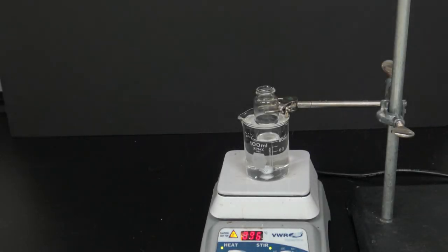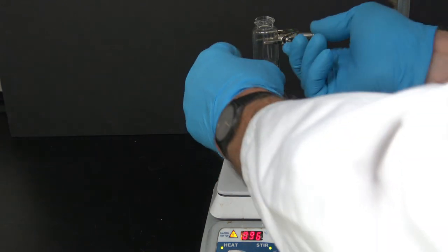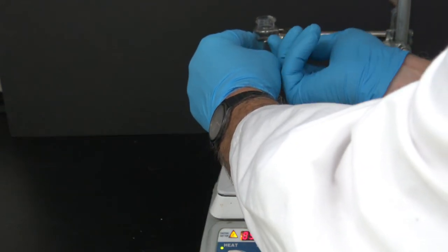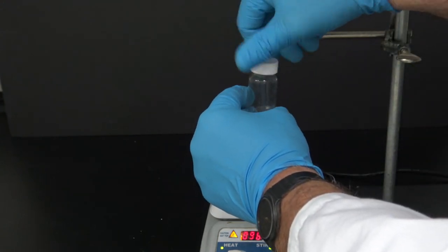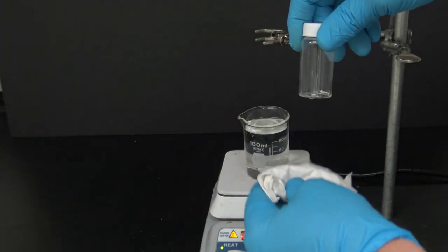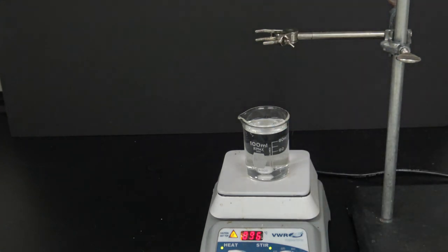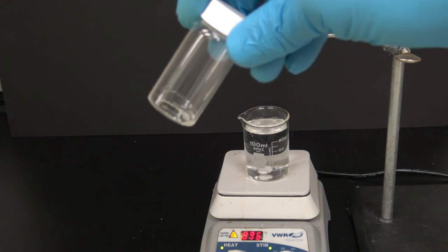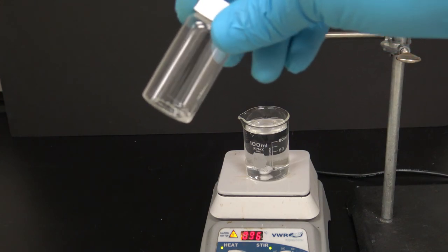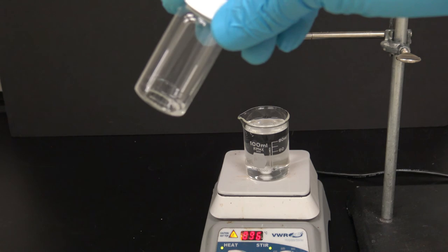It looks like all of the methylene chloride is evaporated, so I'm going to raise my vial out of the hot water bath, remove my vial, put on the cap, then dry the outside of the vial. And I can see that there is still some liquid down at the bottom that has not evaporated, and that would be my essential oils. I'm now going to go weigh this vial so we can calculate how much essential oils we isolated.